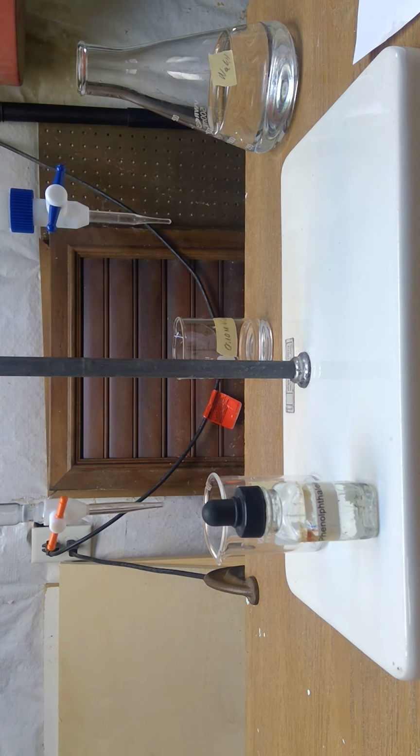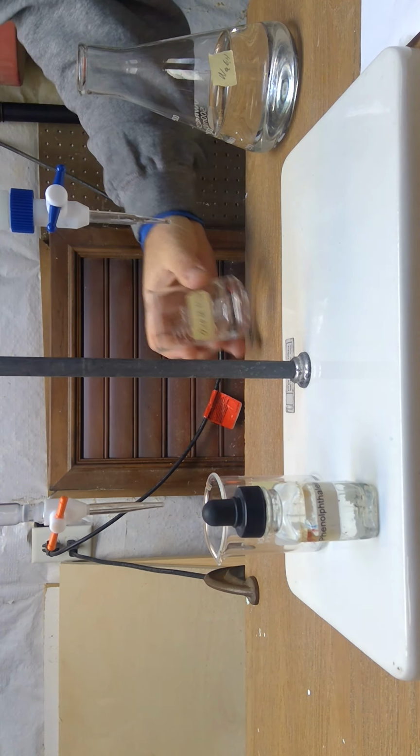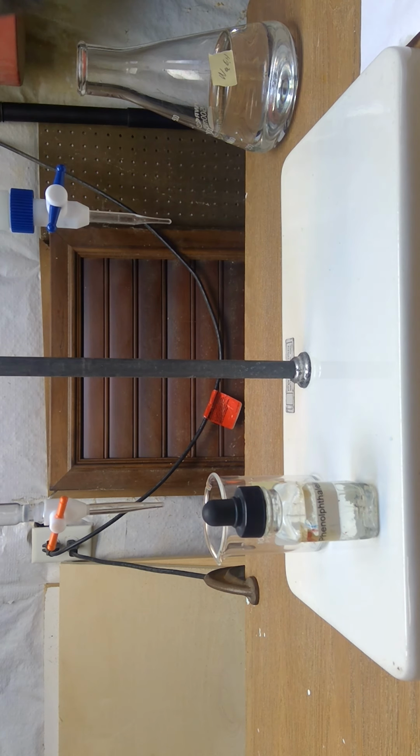Now, our issue is that our sodium hydroxide is way too low. We know we need about 20 milliliters, and I only have about 10 milliliters left. So I'm going to have to refill the burette of sodium hydroxide. So I'm going to go ahead and carefully add.